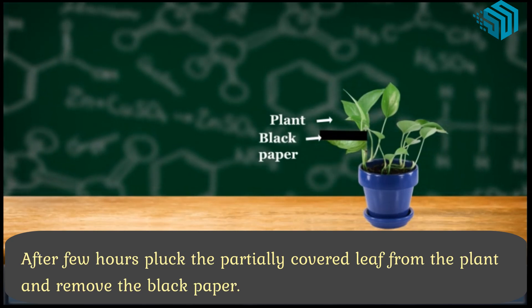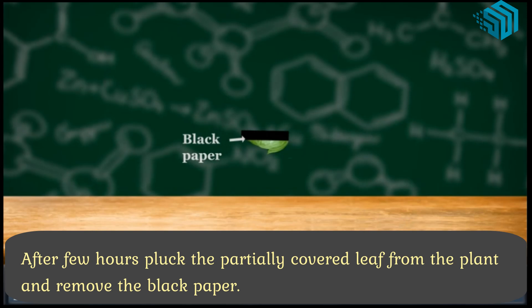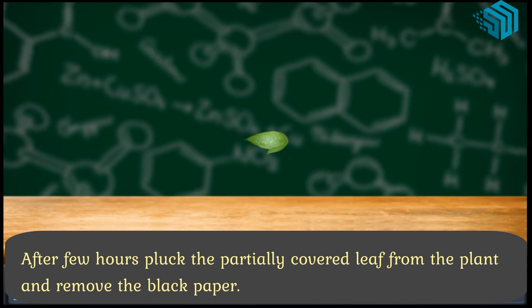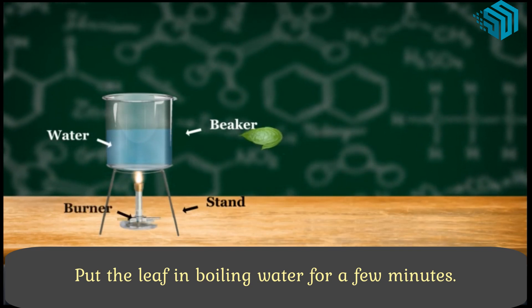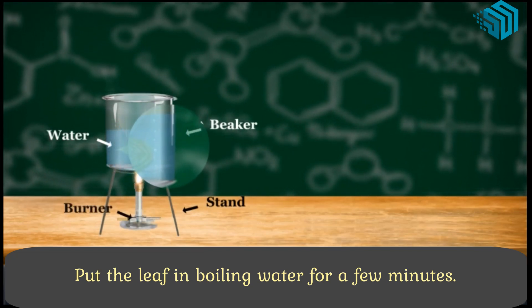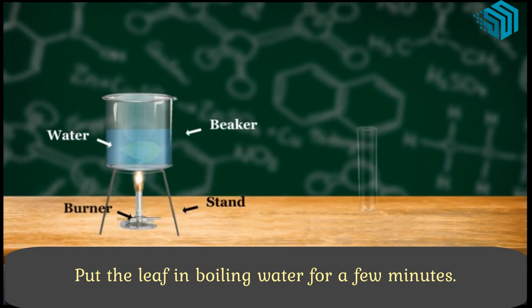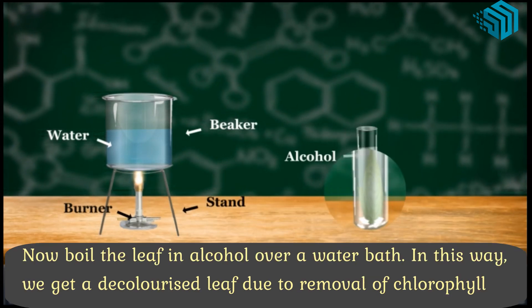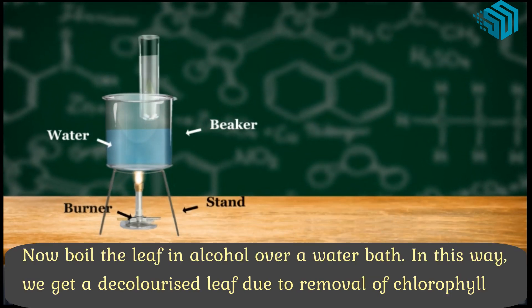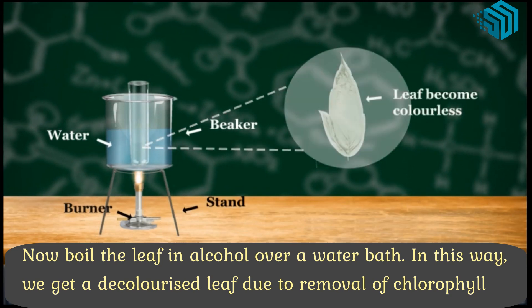After a few hours, pluck the partially covered leaf from the plant and remove the black paper. Put the leaf in boiling water for a few minutes. Now boil the leaf in alcohol over a water bath. In this way, we get a decolorized leaf due to removal of chlorophyll.